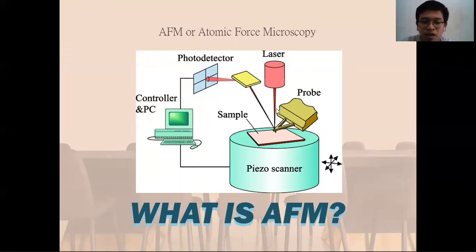In this figure, it shows a schematic diagram of an AFM machine, which has three main components. The microscope stage, which has a moving AFM tip, this is the sample holder, and a force sensor. Second is the control electronics, which has an optical microscope and a vibration controller. And lastly is a computer which analyzes all the processes.